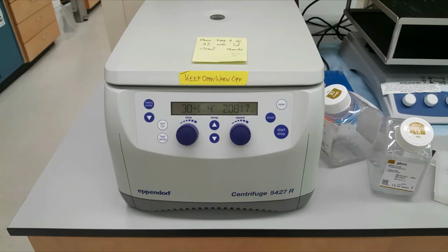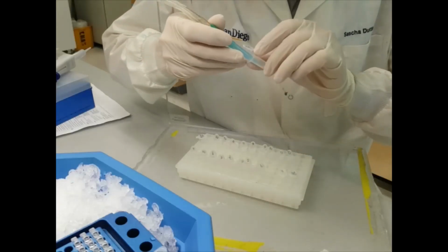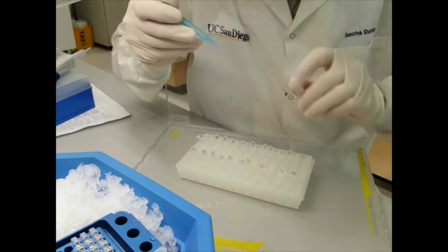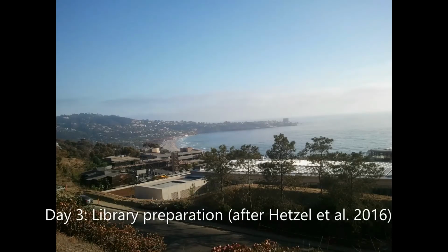Following the precipitation, spin the samples for 30 minutes at 4 degrees at max speed. Aspirate off the isopropanol, wash the pellets, and transfer them, as already shown in the beginning of the video. To start your library prep, you want to have the RNA as a GlycoBlue pellet in a PCR strip tube.